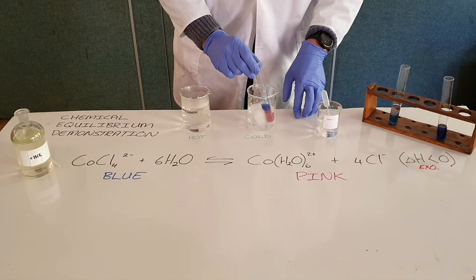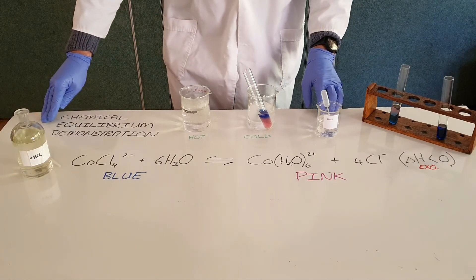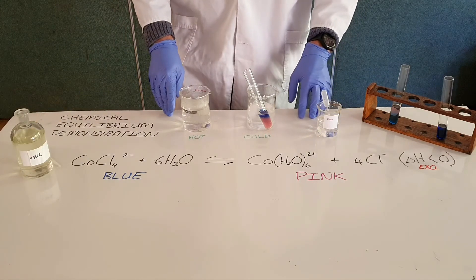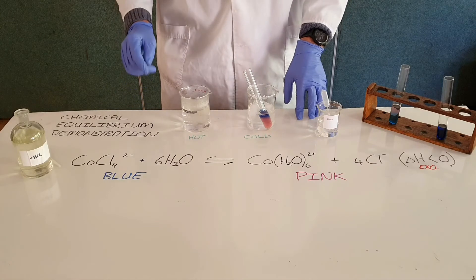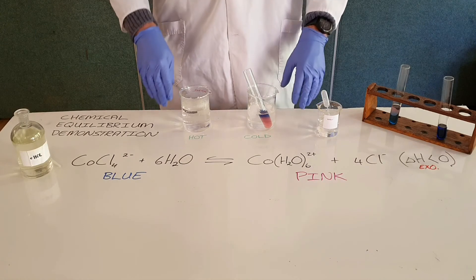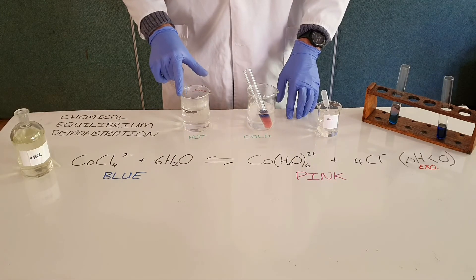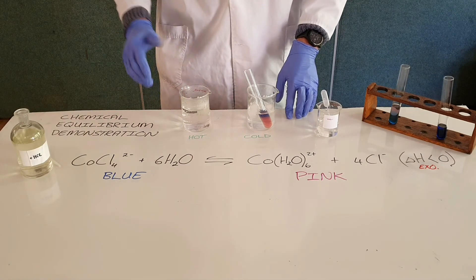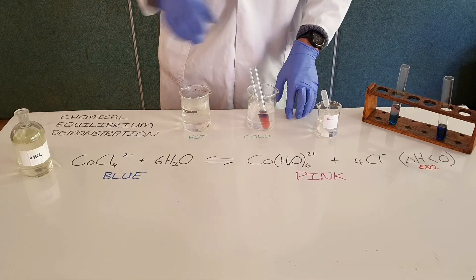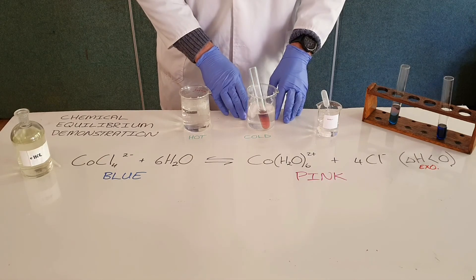We move this solution into our cold water bath and observe the changes. This is all governed by Le Chatelier's principle, which says that once a reaction is at equilibrium, any change made to that reaction mixture will be countered in a way that favors the direction that undoes the change. When we added it to the hot water, it favored the endothermic direction to absorb that heat. When we add it to the cold water, we can see the color going more pink, as the forward exothermic reaction is favored to give off heat to counter the cold temperature.